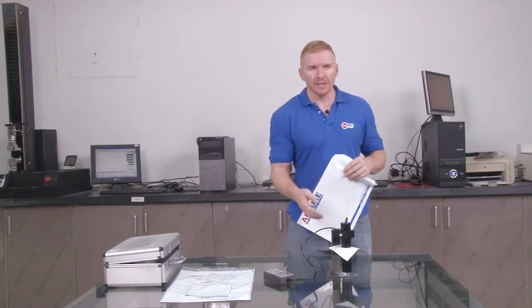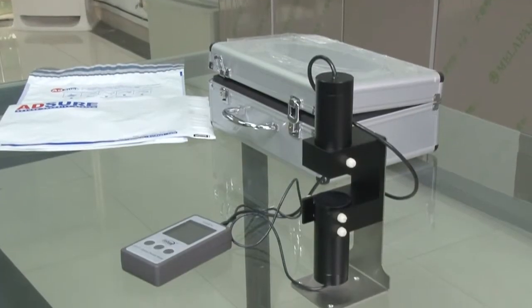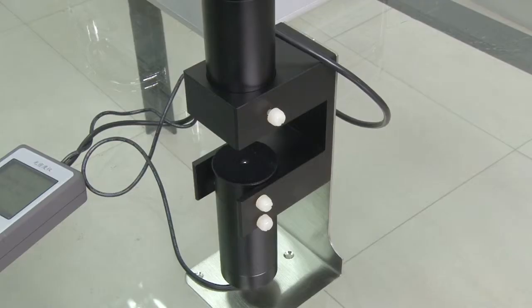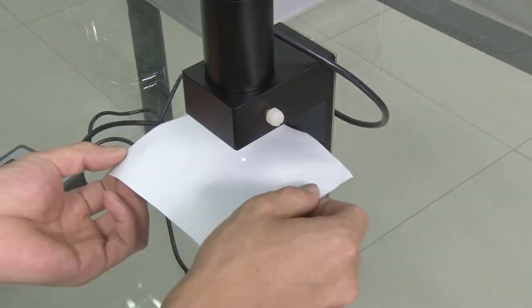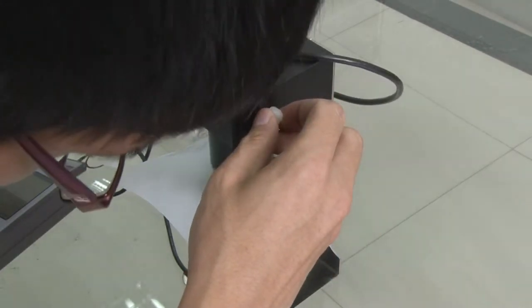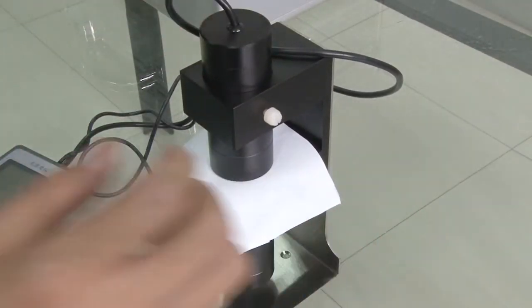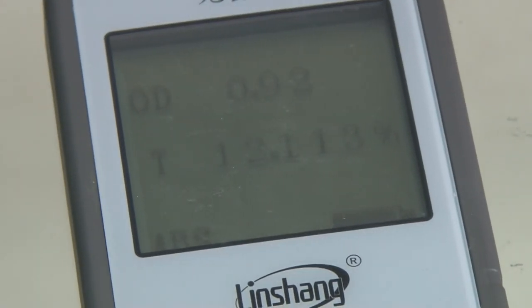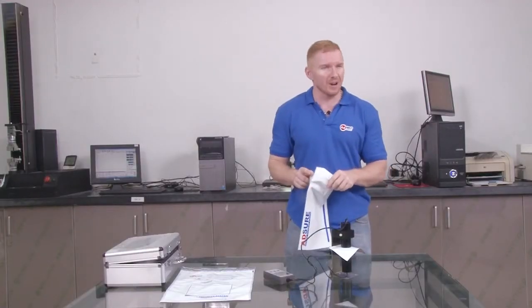This is an optical density meter for testing the opacity of our plastic films. It is very important for our courier bags and tamper evidence security bags. This ensures our customers' packages will remain confidential. We need to use the digital densitometer to measure opacity levels to make sure the bag is opaque enough to ensure confidentiality.